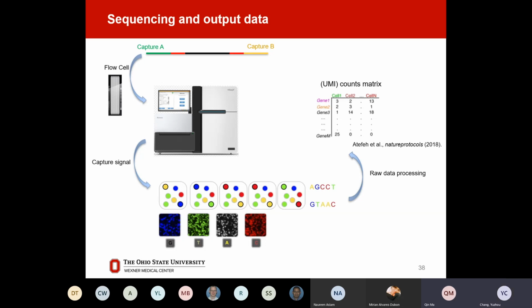Every time you receive data from the sequencing center or company, they automatically generate the data along with a quality check report. You can easily see the data quality and error rate within their report. I'm going to say the space remaining for computational biologists in targeting this problem is getting small, and a lot of companies are designing solutions from there. But again, this is a very important topic.